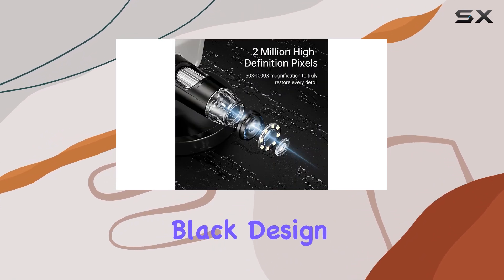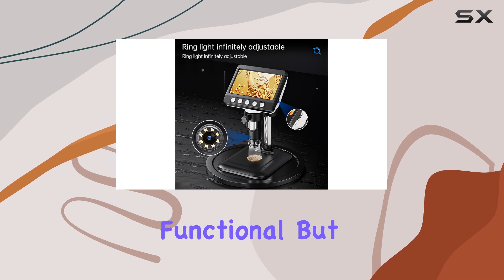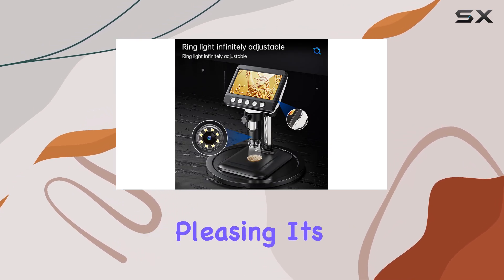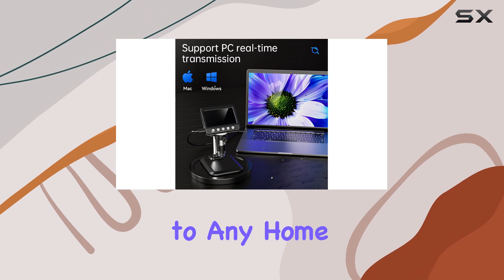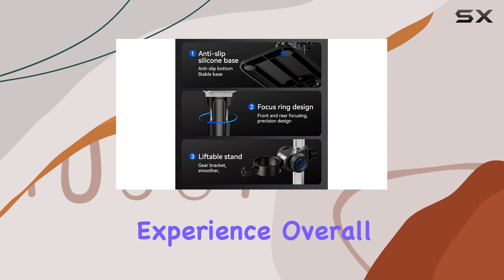With its sleek black design and compact size, this microscope is not only functional, but also aesthetically pleasing. It's a great addition to any home laboratory or classroom, offering an engaging and educational experience.